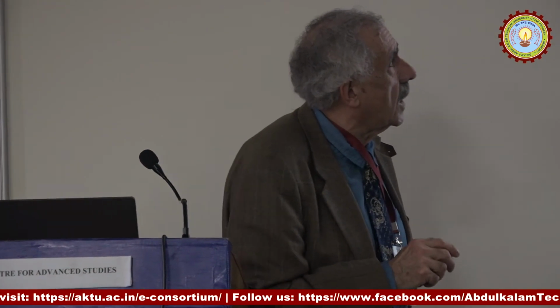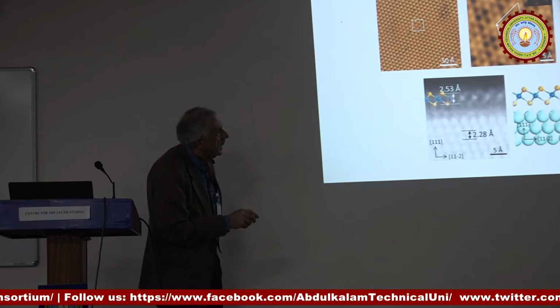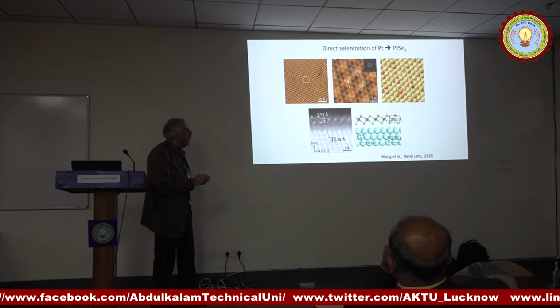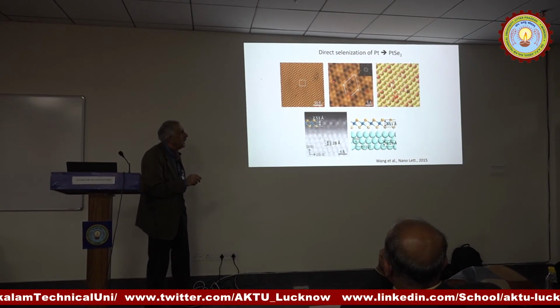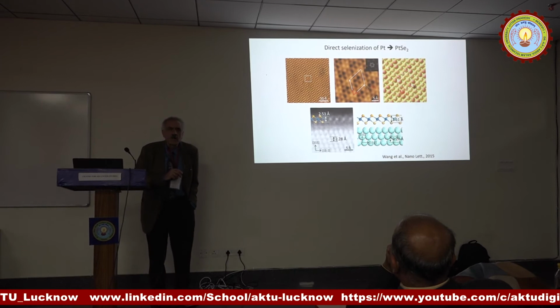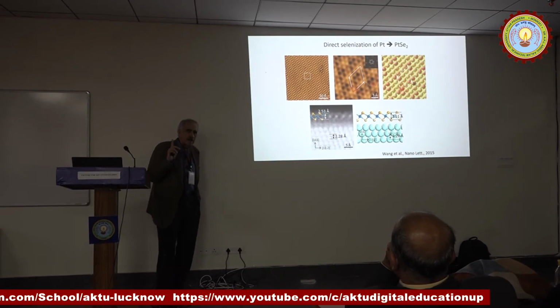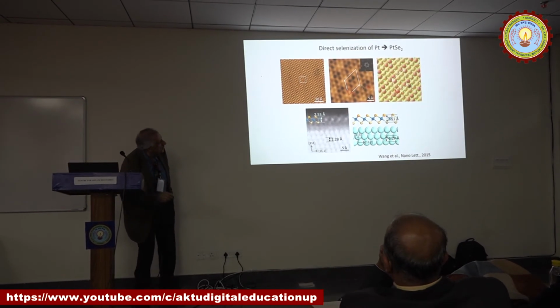This is what we got, an STM image. Here it is at high resolution. We formed the model, and we thought we had it for a while, but we were not sure among different models whether we had platinum selenide or merely a layer of selenium. We needed to confirm that. And that's when we went to the STEM microscope and looked at the thing sideways to see what we had.